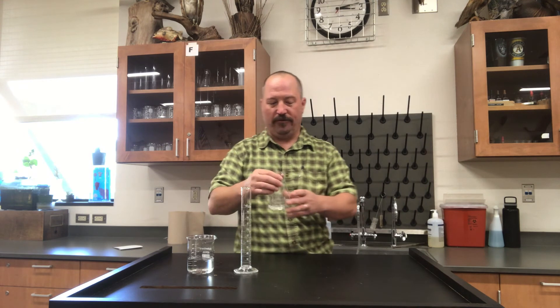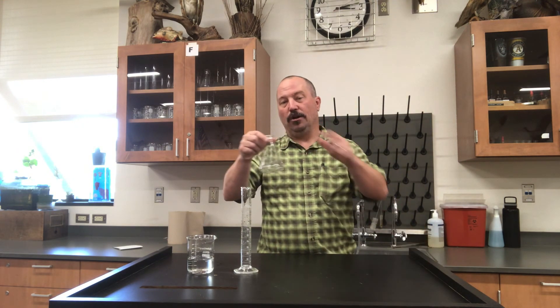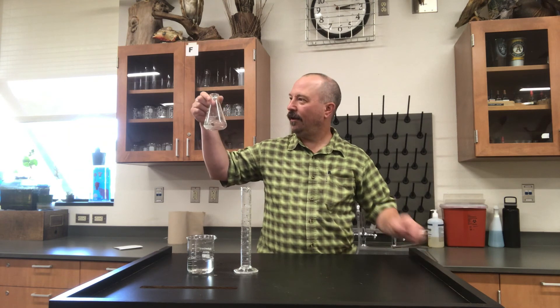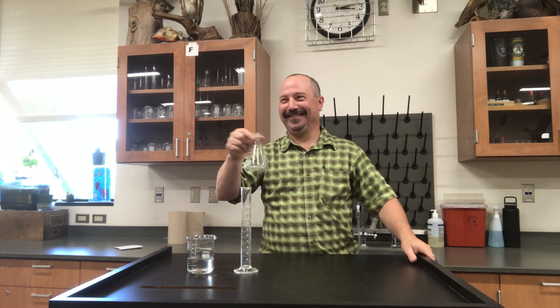Erlenmeyer flasks are more for if you're going to do reactions or mix things, because it has this small opening on top with the volume on the bottom. Plus, this makes you look like a cool scientist. Alright, three types of glassware — Erlenmeyer flask. Now let's go for it.